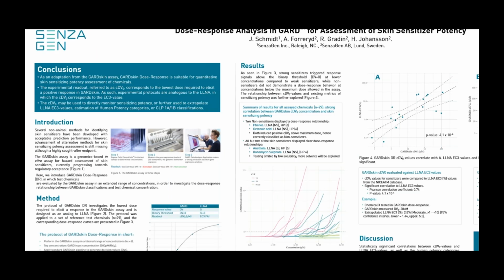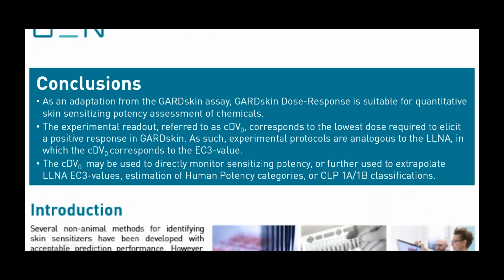In order to summarize the main conclusion from this poster, we here introduce the GARD skin dose response assay as a suitable tool for quantitative skin sensitizing potency assessment of chemicals. We also propose a protocol that can be used as a tool for risk assessment of chemicals and mixtures without the use of animal experimentation. And the experimental readout that we use, which is here referred to as the CDV0 concentration, corresponds to the lowest concentration required to elicit a positive response in the GARD skin assay.